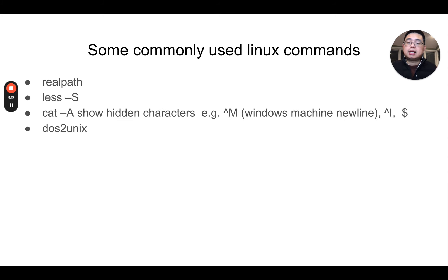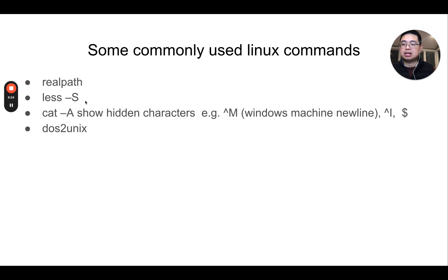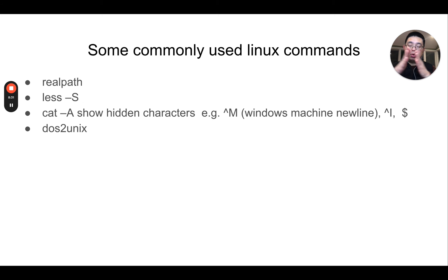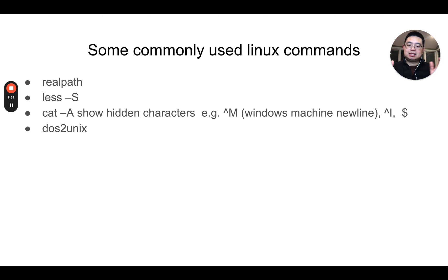There are some commonly used Linux commands worth mentioning. For example, realpath gets the full path of a file — just type realpath with a file name and you'll get the full path. And less -S: when a file's rows are too long, printing them out causes wrapping. But with less -S, the lines won't wrap and you can use the left and right arrow keys to navigate the file.